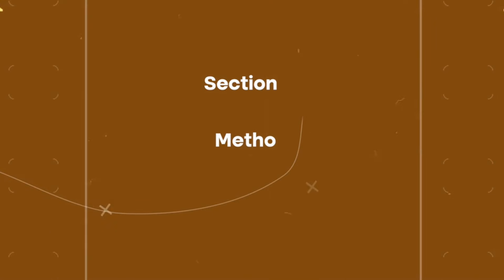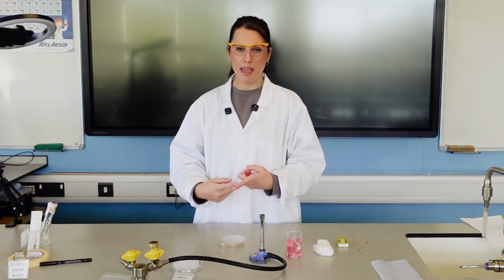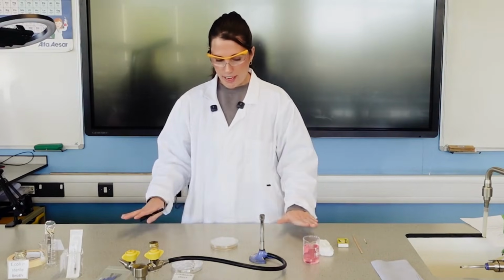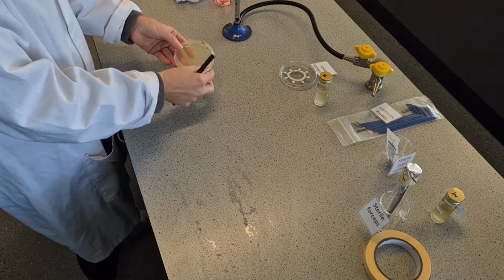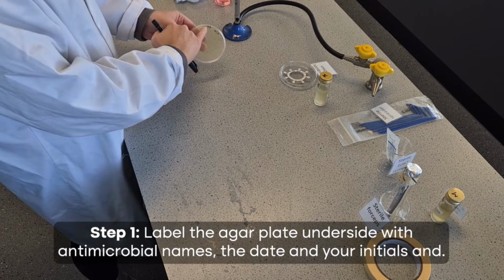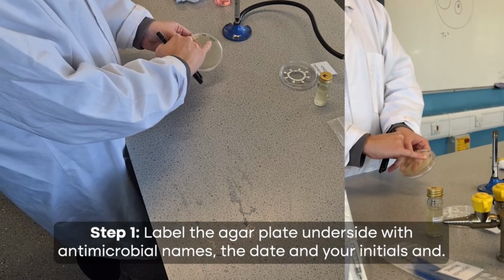But now let's get into the actual practical, and as we go through, I'll point out some key mistakes students make so that you can point it out to them so they don't, and some key tips as well. So I've washed my hands with soap, I've disinfected the surface, I've got my roaring Bunsen burner flame set up. I've actually got some labels already on my Petri dishes because these were pre-made by the technician. So at the moment it's just saying it contains only nutrient agar, and that was created on this date.